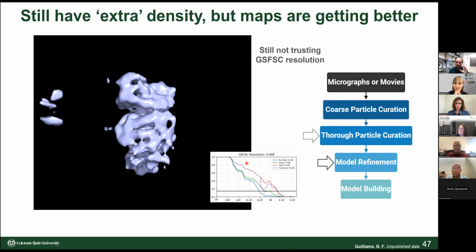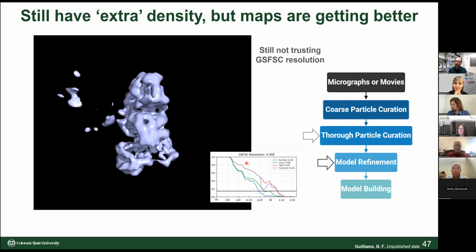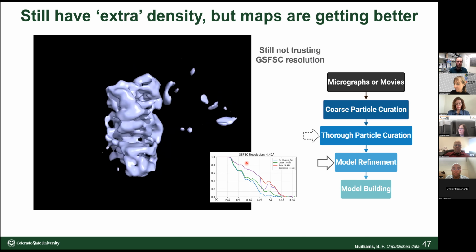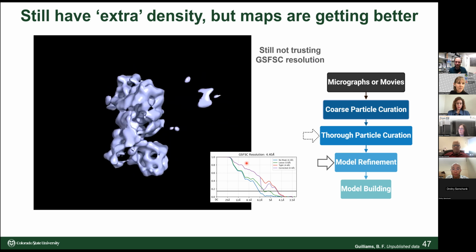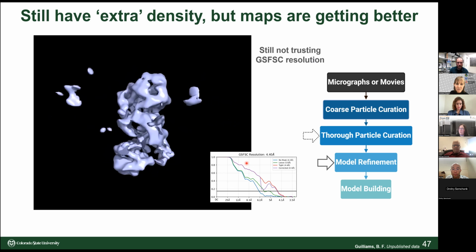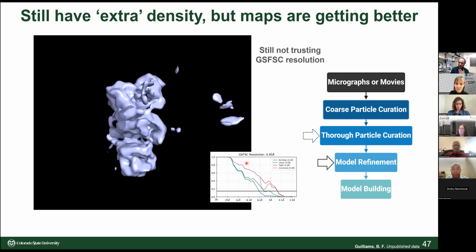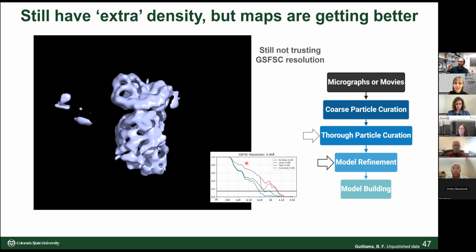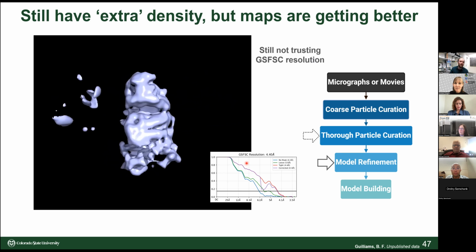I would say the defocus didn't look off. I'll go back now that you said that and do a closer inspection of it, but it would look pretty normal based on, I would say, Glacios data that I had processed. So that's kind of strange. Yeah, now that you mention it, it wasn't something that flagged. There were definitely moments along the way I was a little bit confused. I was like, huh, that's a little weird. I guess I'll just keep going and see what happens.